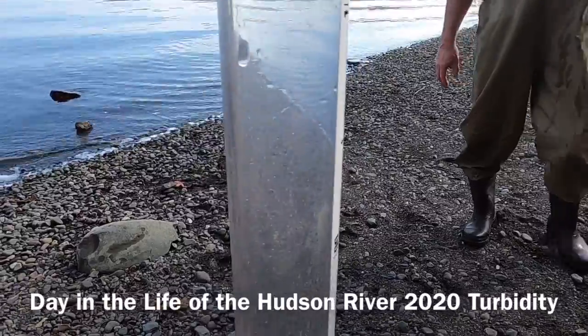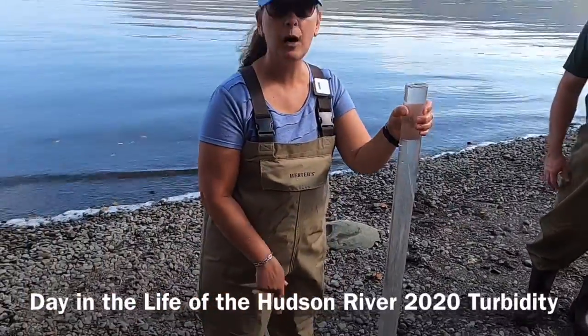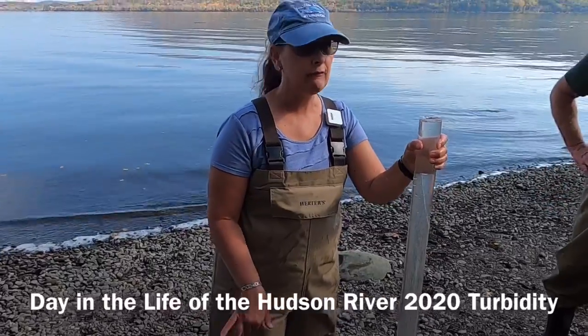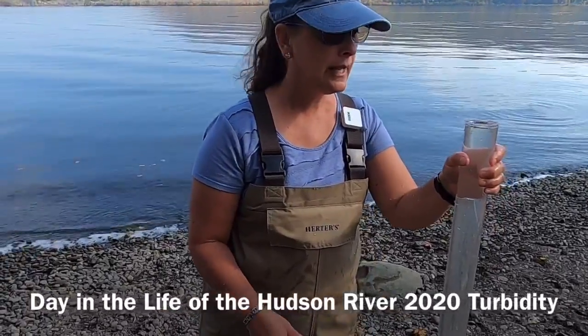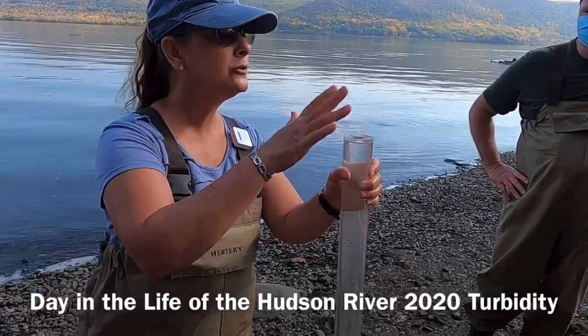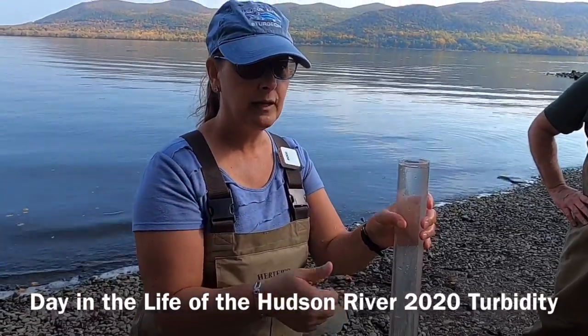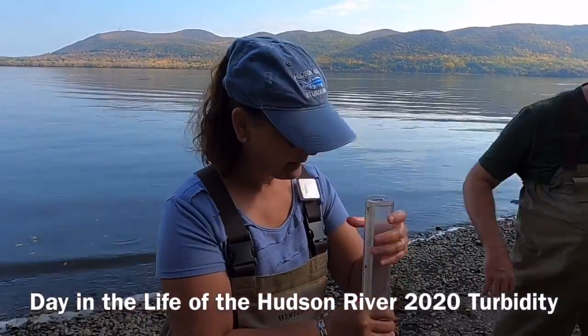All right, now the way that we're going to do the sample is that there's a valve at the bottom, right? So that valve is going to get opened, and one person is going to look through the tube, and as soon as the distinction between the black and white is met, then we're going to close that valve and take the reading. Okay.